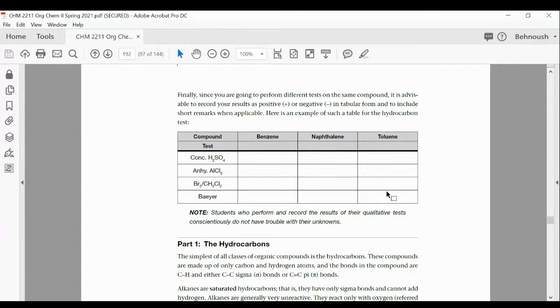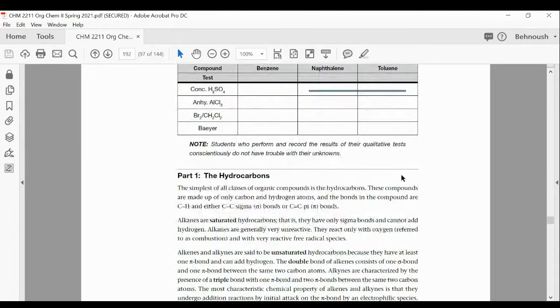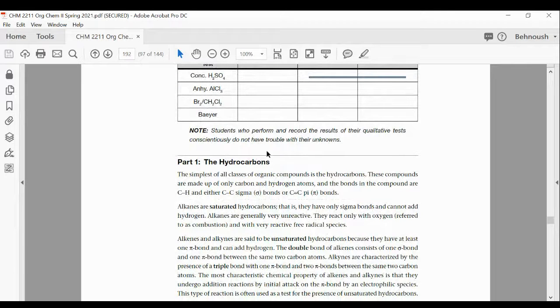Okay. So you're going to practice with the known samples, then you will get the unknown. So I want you to pay attention, even though when you look at this diagram, so you have this table, you are going to write the information in these cells as a written statement, a short sentence, or just evidence for the reaction. Yes, precipitate. Yes, color change. Yes, soluble. No reaction. But be as detailed as possible for your own reference, because when you do unknown, you can go back to this lab notebook and check what was the behavior of this known sample.